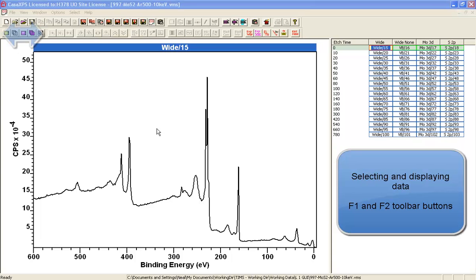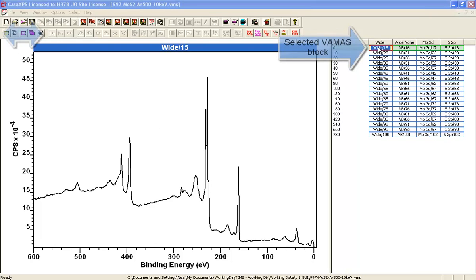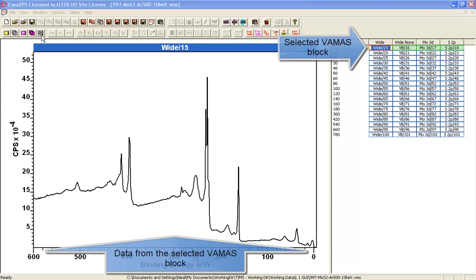The data you see on the left side is determined by the selection on the right side and these toolbar buttons here.